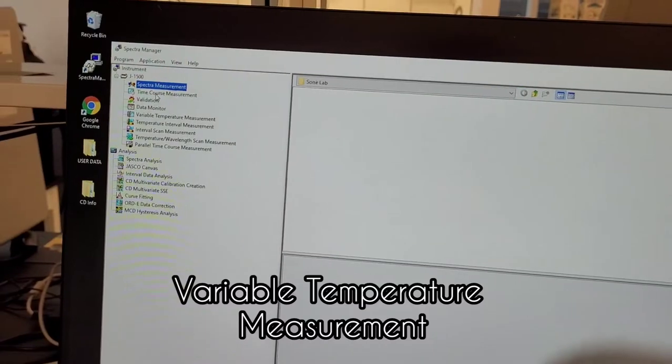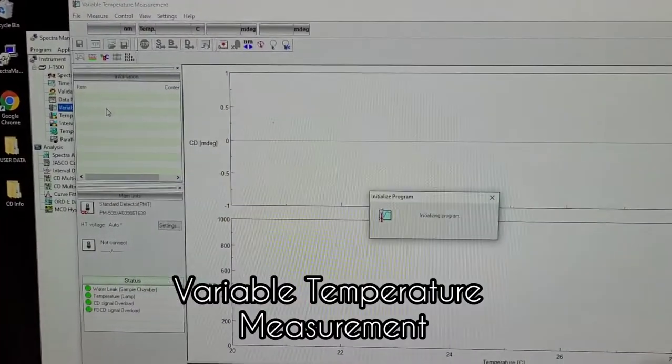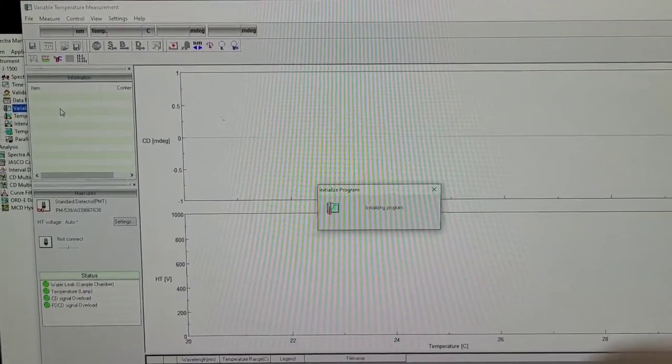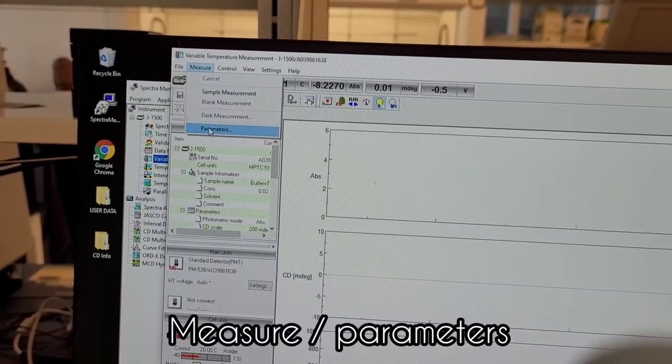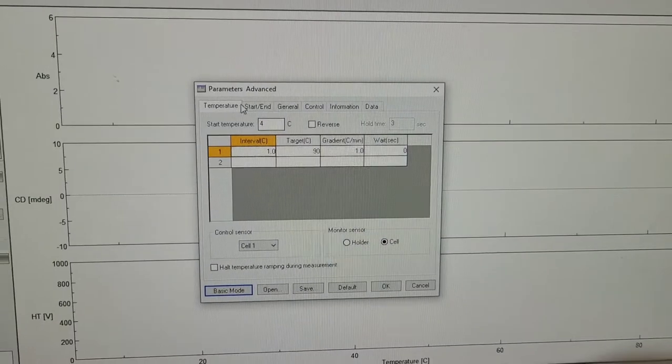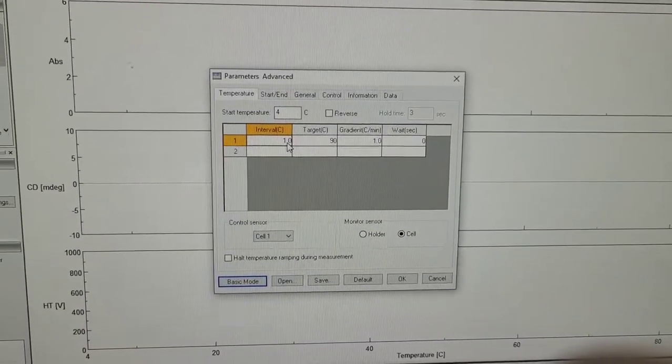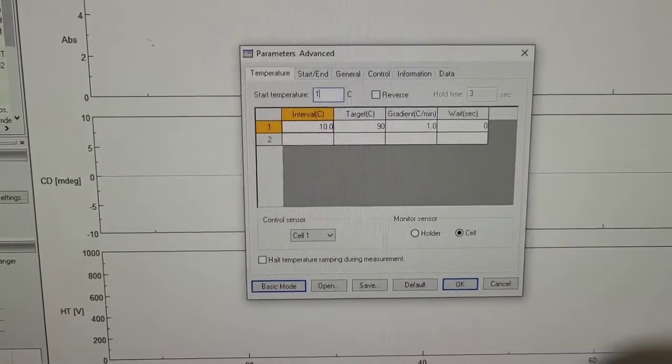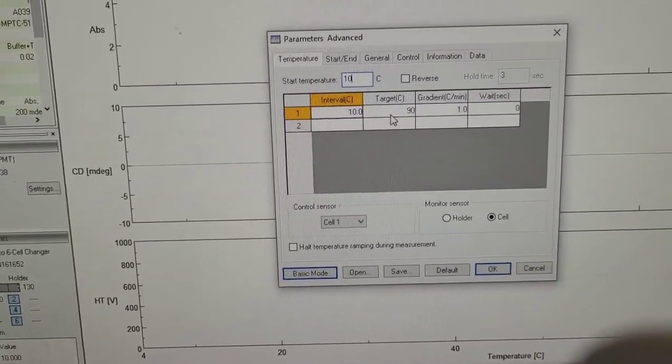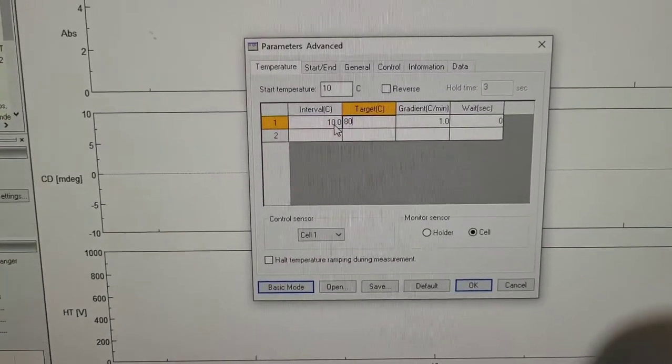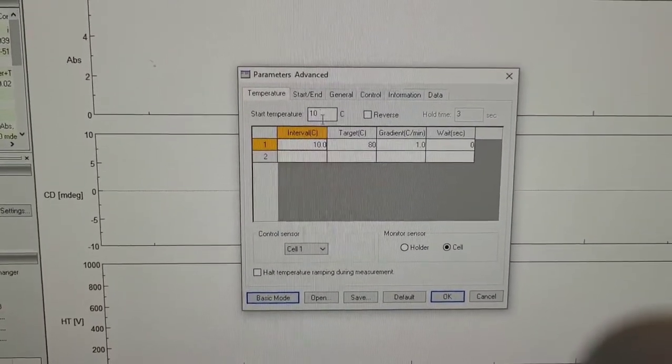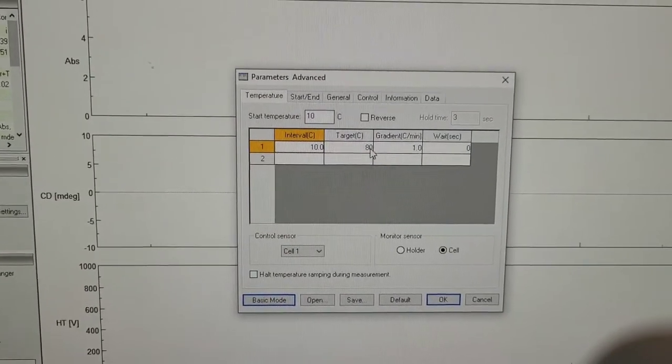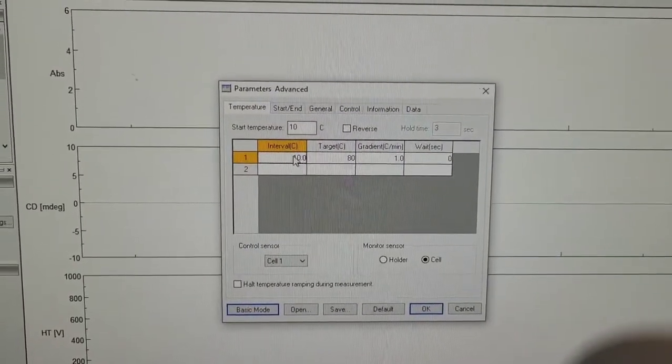We'll go to the variable temperature measurement. Then you want to go to measure and go to parameters. So I start at 10 degrees and go to 80 degrees, but you can do more or less, but this is a good range. 10 degrees is definitely folded and 80 degrees is definitely unfolded and disordered.